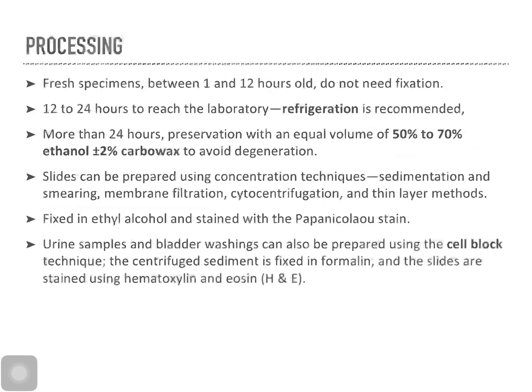The slides can be prepared using concentration techniques: sedimentation and smearing, membrane filtration, cytocentrifugation and thin layer methods. These slides are fixed in ethyl alcohol and stained with Pap stain. Urine samples and bladder washings can also be prepared using the cell block technique. The centrifuged sediment is fixed in formalin and the slides are stained using H&E.